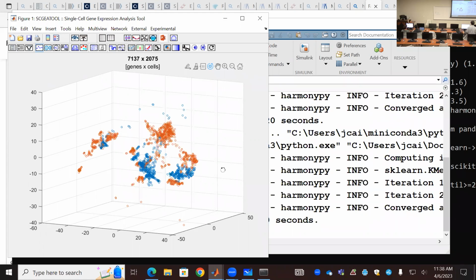Oh, you haven't installed it. Let's see which one you are using when you code on Python. I think we had two. I had two versions. You installed two, yeah. You point to the wrong Python, yeah. I think you can select if you know where it is. Yeah, so select. Use another, then you select.